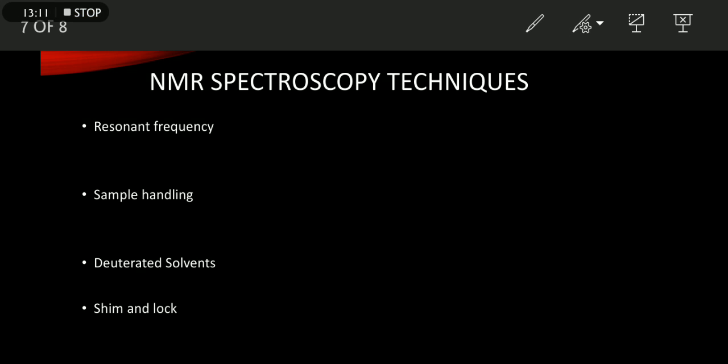All the other solvents may be used for various reasons, such as solubility of the sample or the desire to control the hydrogen bonding. The chemical shifts of a molecule will change slightly between solvents, and the solvent used will almost always be reported with the chemical shifts. The NMR spectra are often calibrated against the known solvent residual proton peak instead of added tetramethylsilane.